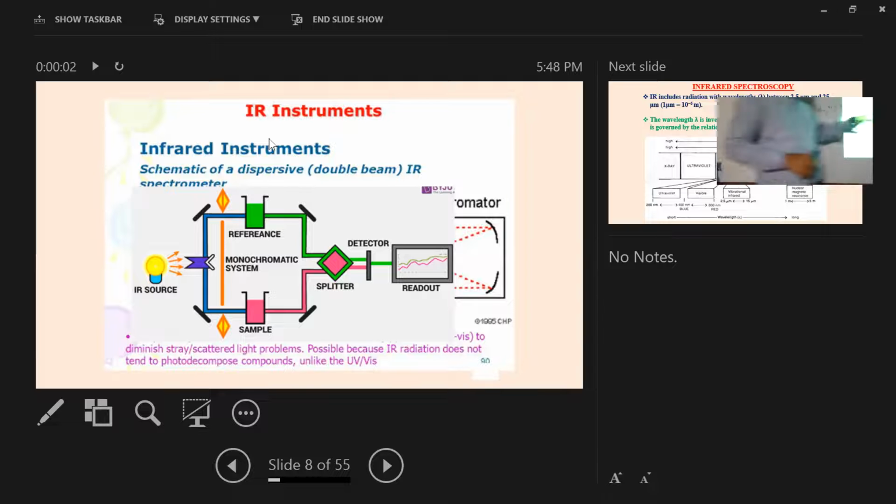So you are giving different energy from the source, and if the water molecule is continuously vibrating, only in these three different types of modes. Sometimes it is bending, and sometimes symmetric stretching, anti-symmetric stretching, like this.